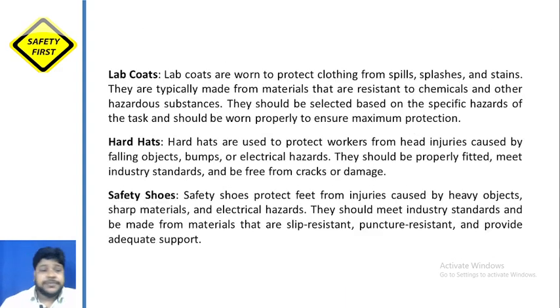लैब कोट्स. जहाँ पे कुछ इस तरह का रिस्क है वहाँ पे हमको लैब कोट पहनना होता है. मेनली केमिस्ट्री लैब में अगर हम लोग जाते हैं या कोई ऐसा लैब होता है जो क्लीन लैब होता है वहाँ पे पहनते हैं. या ऐसा कुछ रेडिएशन का रिस्क है तो भी हमको एक लैब कोट्स पहनने होते हैं. There are many tasks where we need to have lab coats और जैसा रिस्क है उस तरह का लैब कोट.